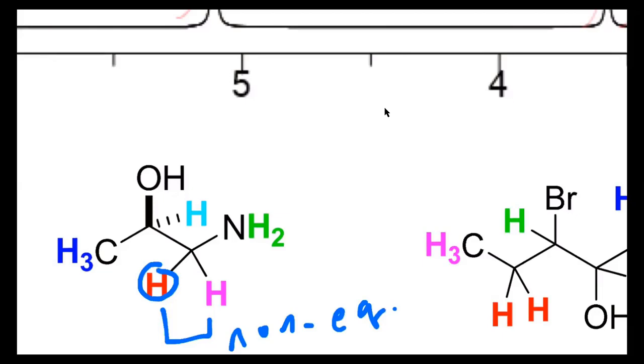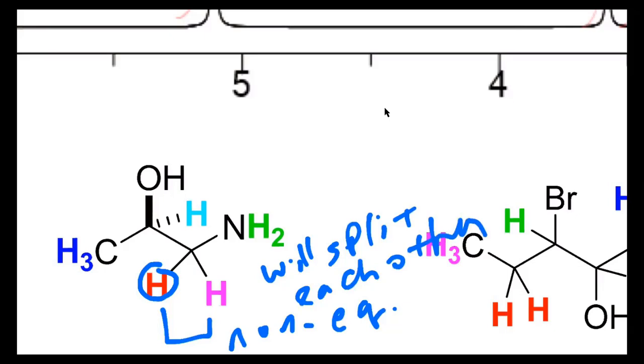Because those are non-equivalent, they actually split each other. So this proton is going to split with this proton, and it's going to split with this proton.